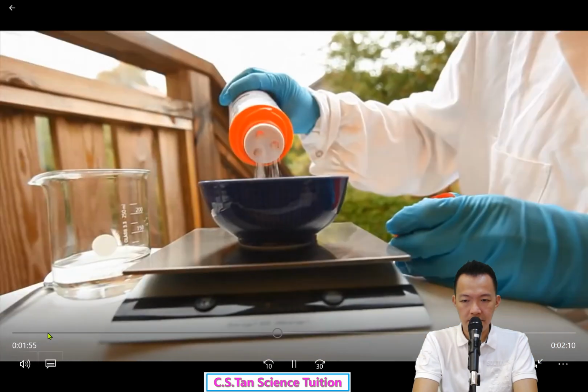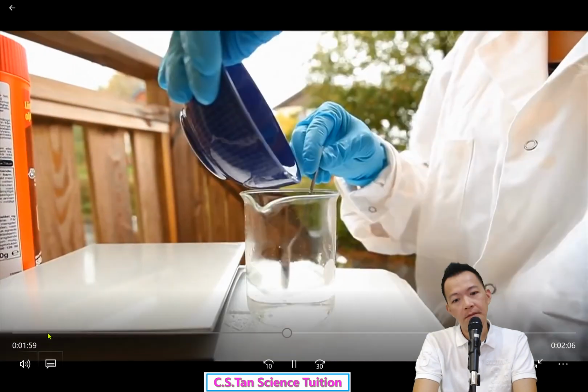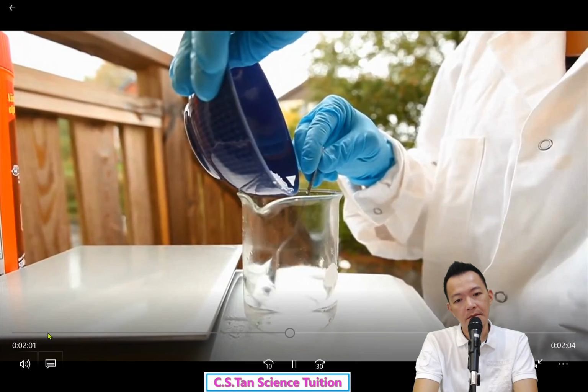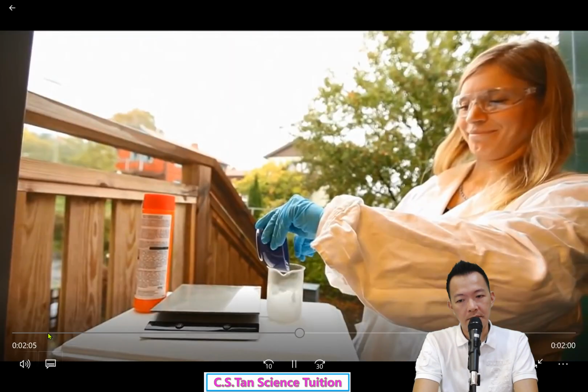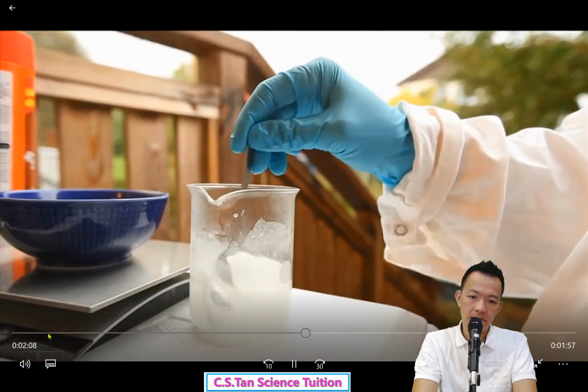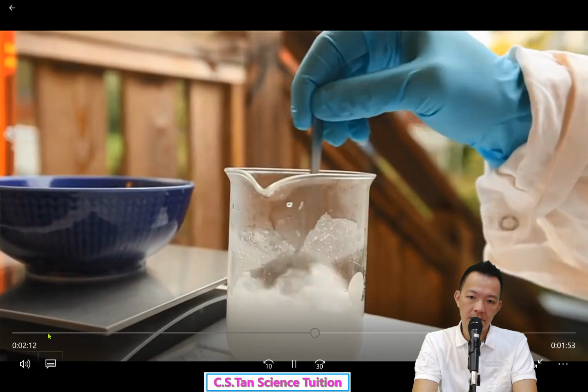Measure the right amount of sodium hydroxide and then carefully pour it into the water while stirring. It's very important that we dissolve the sodium hydroxide in the water and not the other way around. The solution is not just very basic, the temperature also changes. When we dissolve the sodium hydroxide in the water, the solution gets really hot.